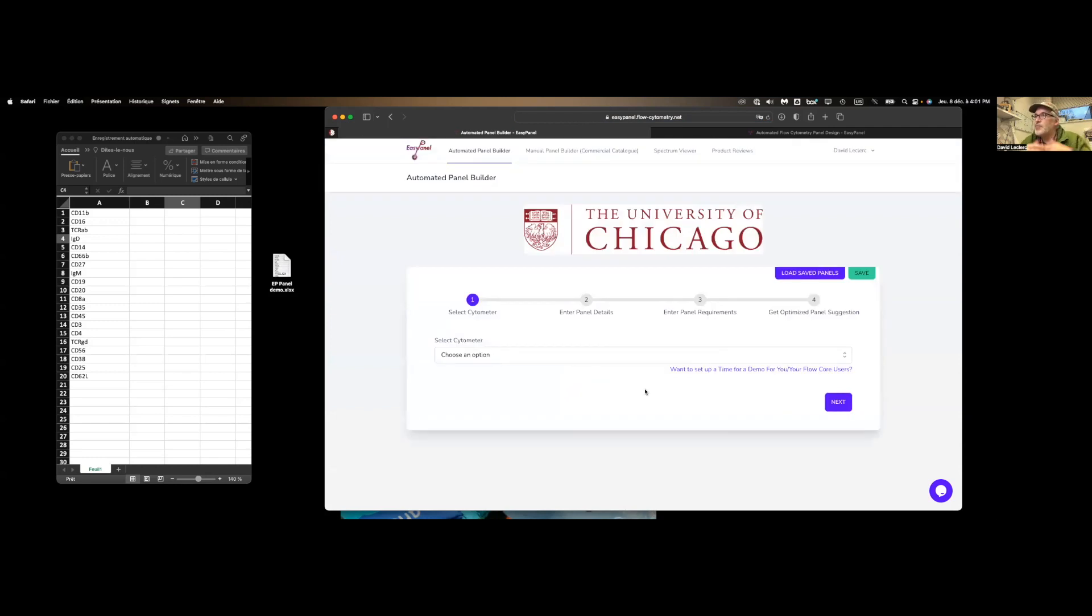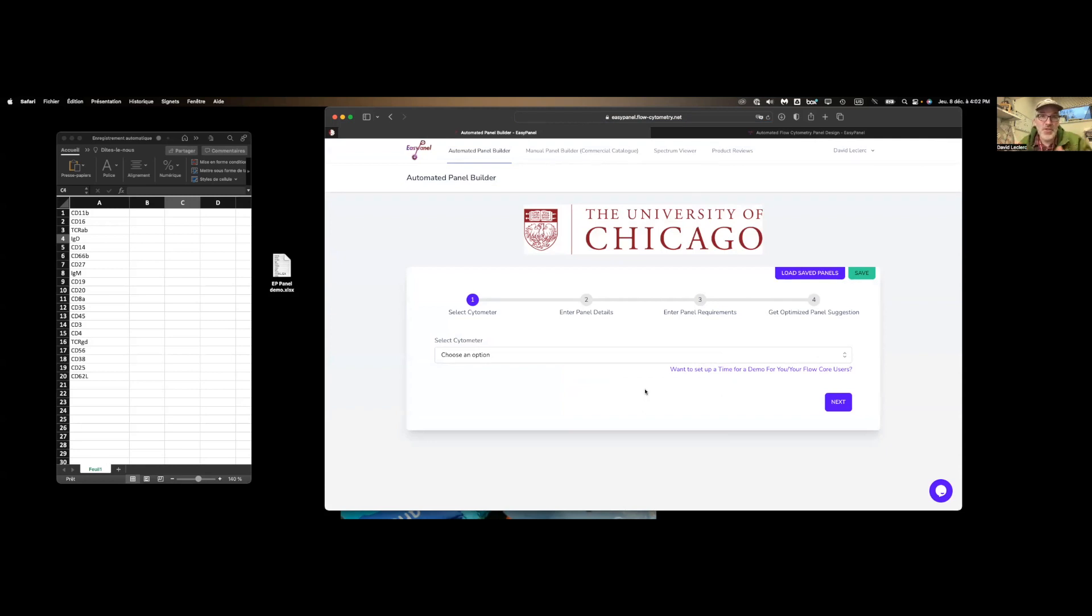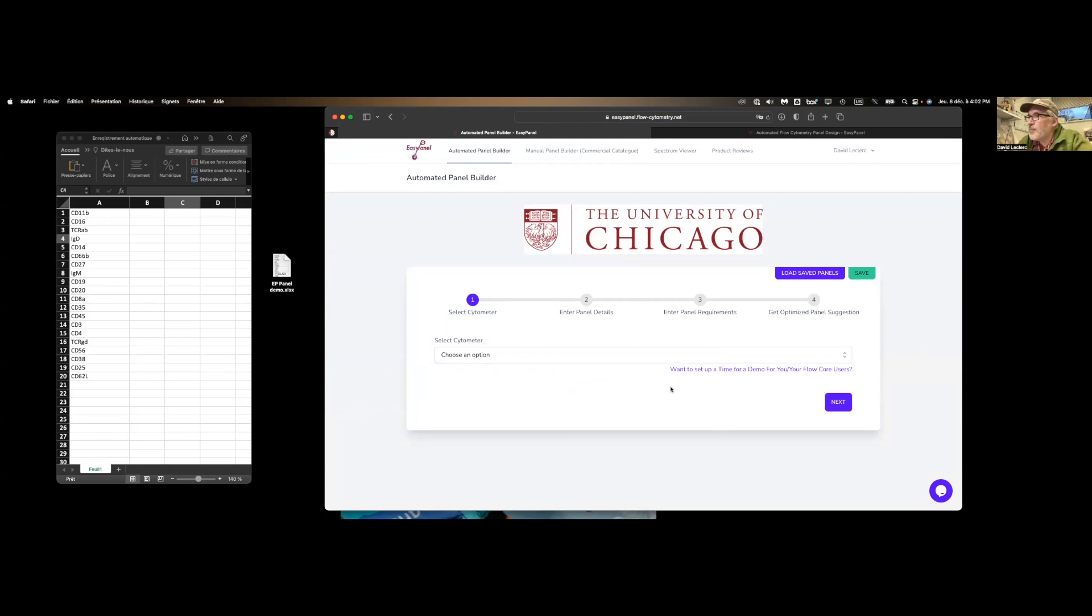And these panel design tools, they all look alike. Flow Finder and pretty much any manufacturers of instruments or reagents now seem to have their own panel design tool. They follow the same steps. But EasyPanel does the one thing that puts it on top of pretty much everybody else, in my opinion.